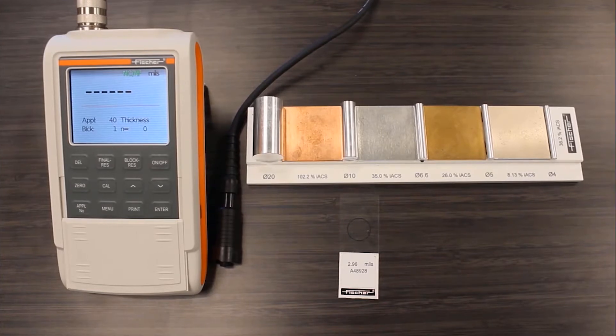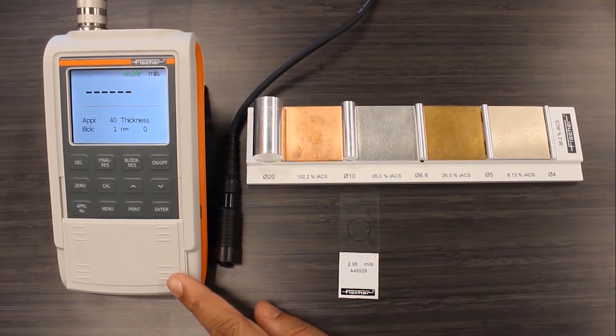Coating thickness can be easily measured on flat surfaces with magnetic induction or eddy current technology. But this becomes challenging when the coating is applied to a curved surface. Today we will talk about measuring the coating thickness precisely on curved surfaces.